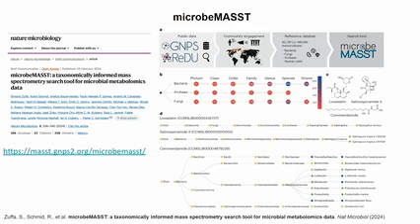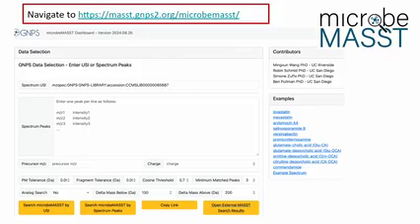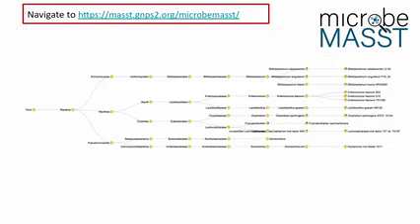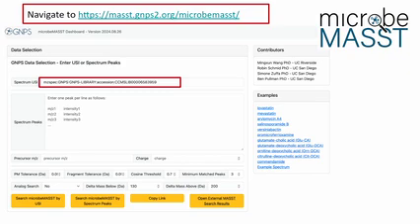So you just need to be a little bit careful on how you interpret this data. When you access that link, you're going to get to this interface here. And again, everything works with the USI, because it's just faster and you don't have to provide the precursor mass and the charge again. So you just copy paste the USI and put it right here in the spectrum USI, and you keep all the other parameters by default.